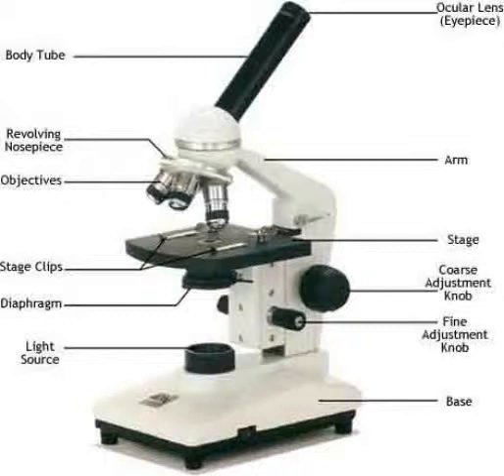Introduction. In almost every type of biological research, the microscope plays a fundamental role. Scientists in each field rely on it to study the fine structures of cells and tissues, things too small to see with the unaided eye. Were it not for the microscope, our understanding of life would be far different from what it is today.